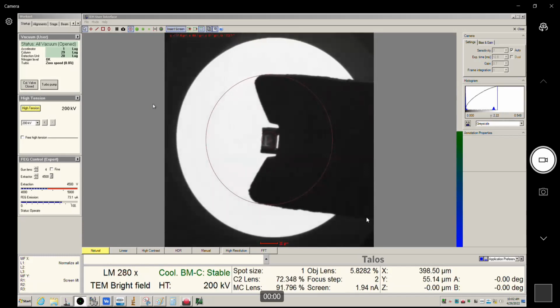One thing I would like to point out is a functionality that's not in the SOP, but you do have the ability on this instrument, and I think pretty much any modern TEM, to store stage positions. If you want to move quickly between lamellas, there's a lamella here.